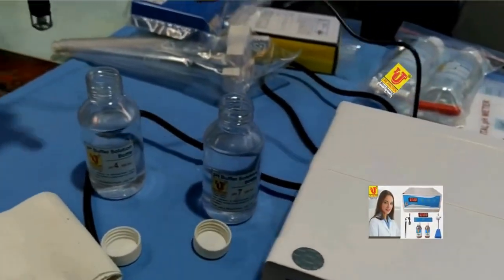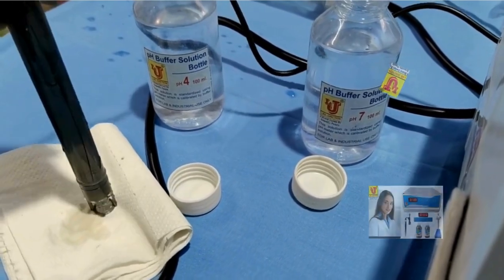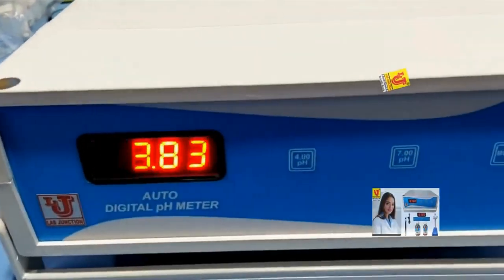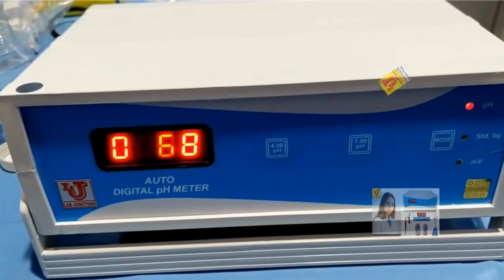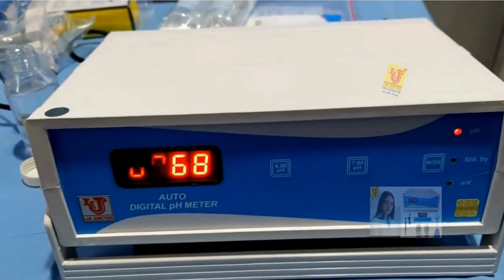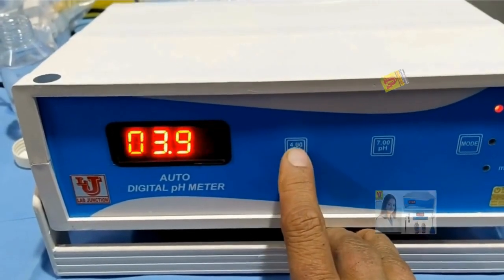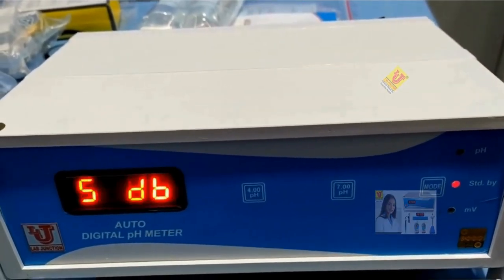Now insert your electrode into the pH 4 buffer solution. First, rinse and refresh the electrode with tissue paper. I am dipping it into the pH 4 buffer — the reading shows 3.74. Shake the electrode in the buffer solution to get a proper reading; now it shows 3.68. Press the 4 key to calibrate at pH 4. If there is an overlap, press the 4 key again — 4 calibrate. Now go to standby and your instrument is calibrated.